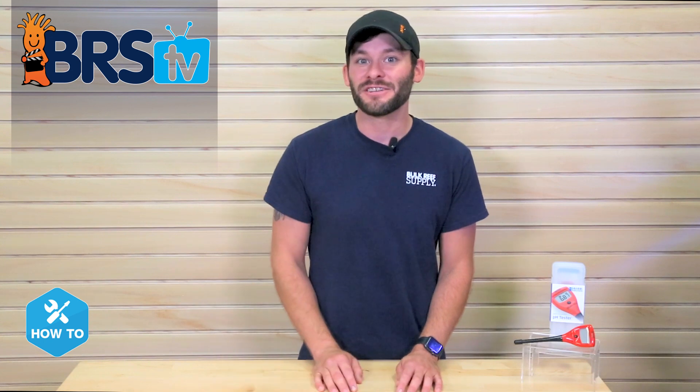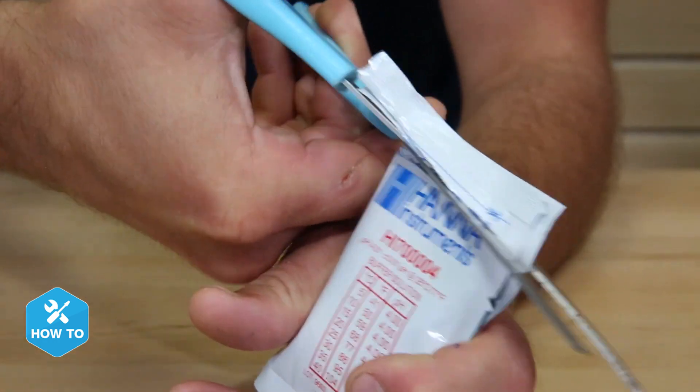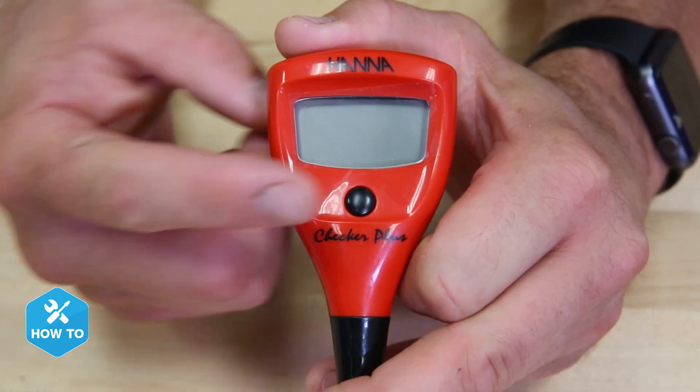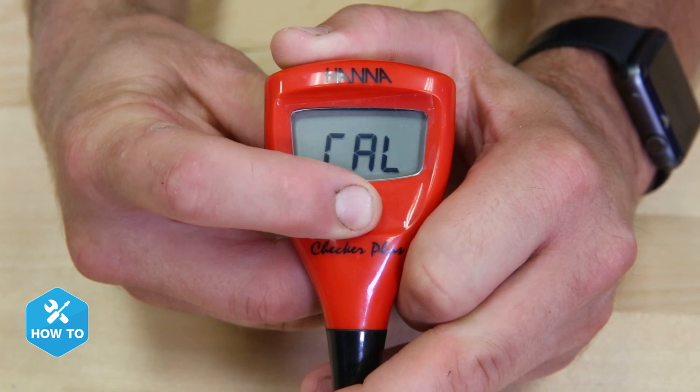Calibrating and testing with this checker is quick and simple, so let's take a look at how to set one up. The first thing we'll want to do is calibrate the checker, and I like to prep my calibration solutions by having them open and ready to go. Then I'll turn on the checker, let it cycle on, and press and hold the button until I see the calibration screen.